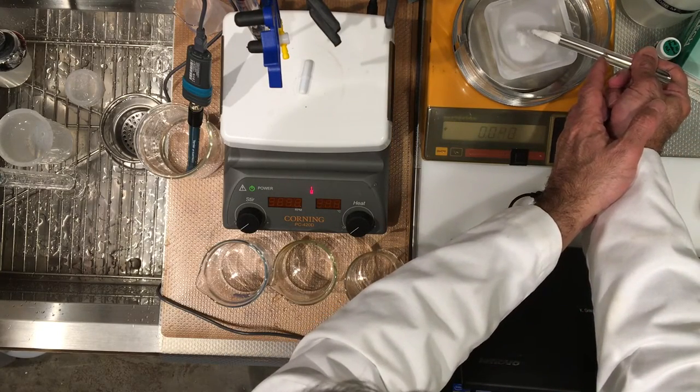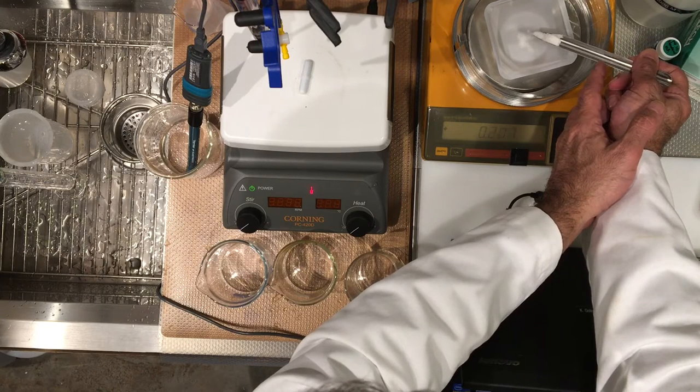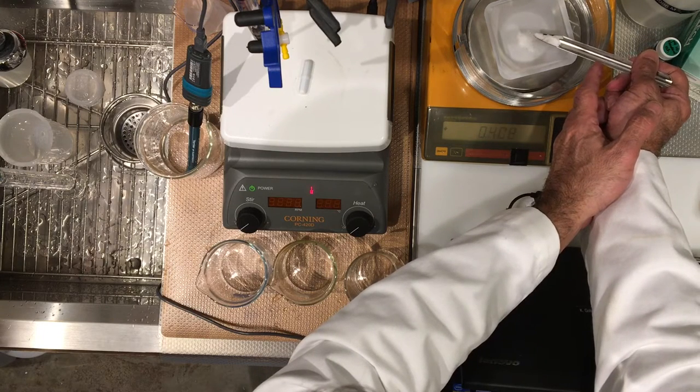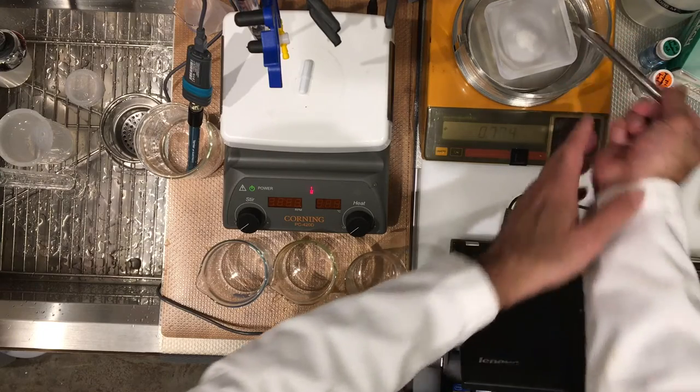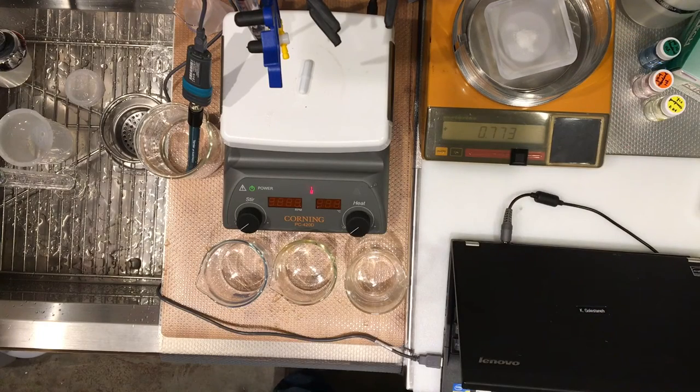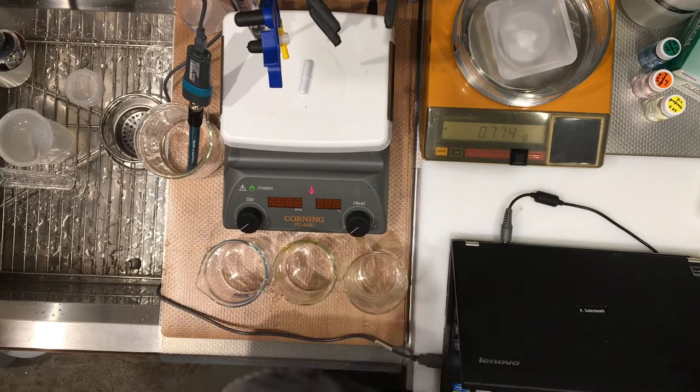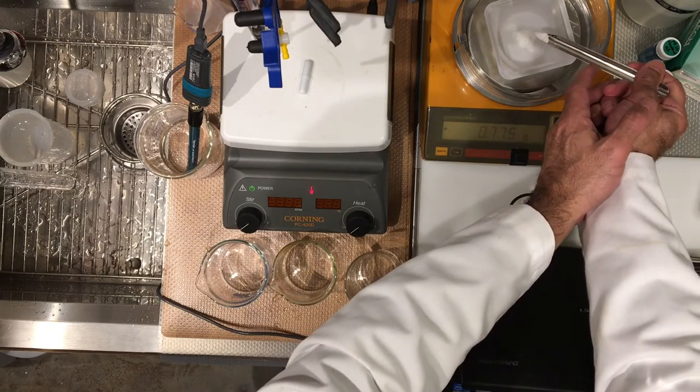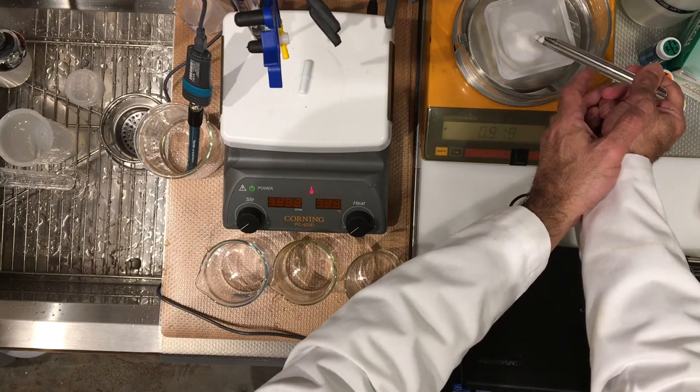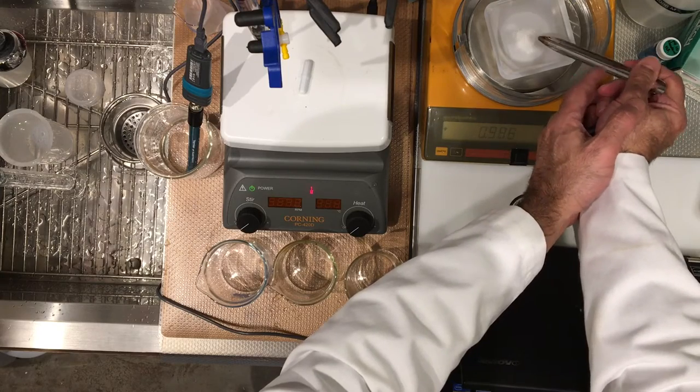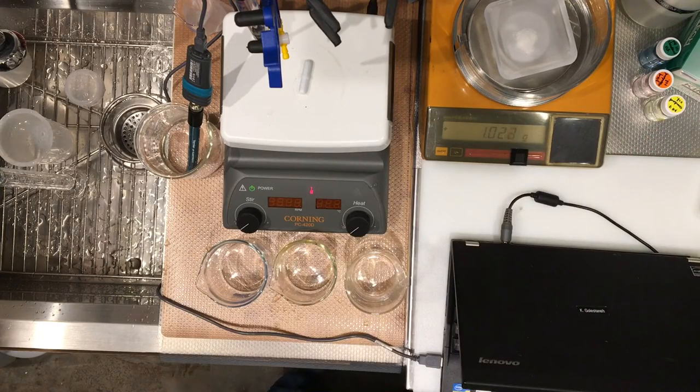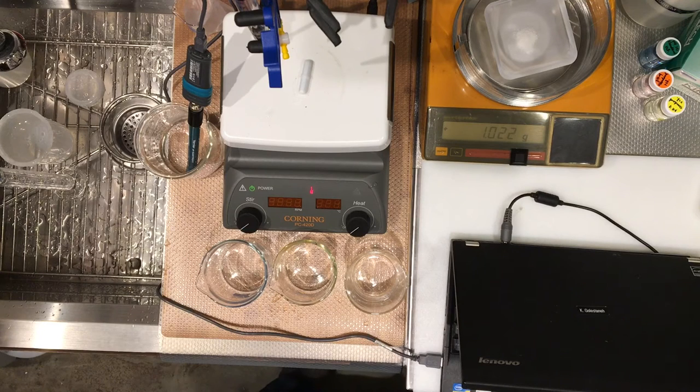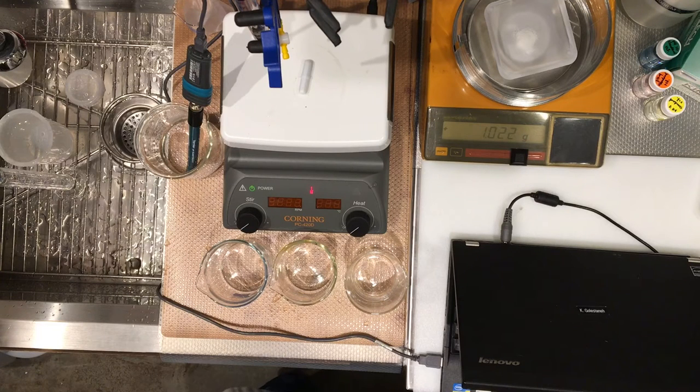If I need more. Okay, that's perfect. So first mass, 1.022 grams.